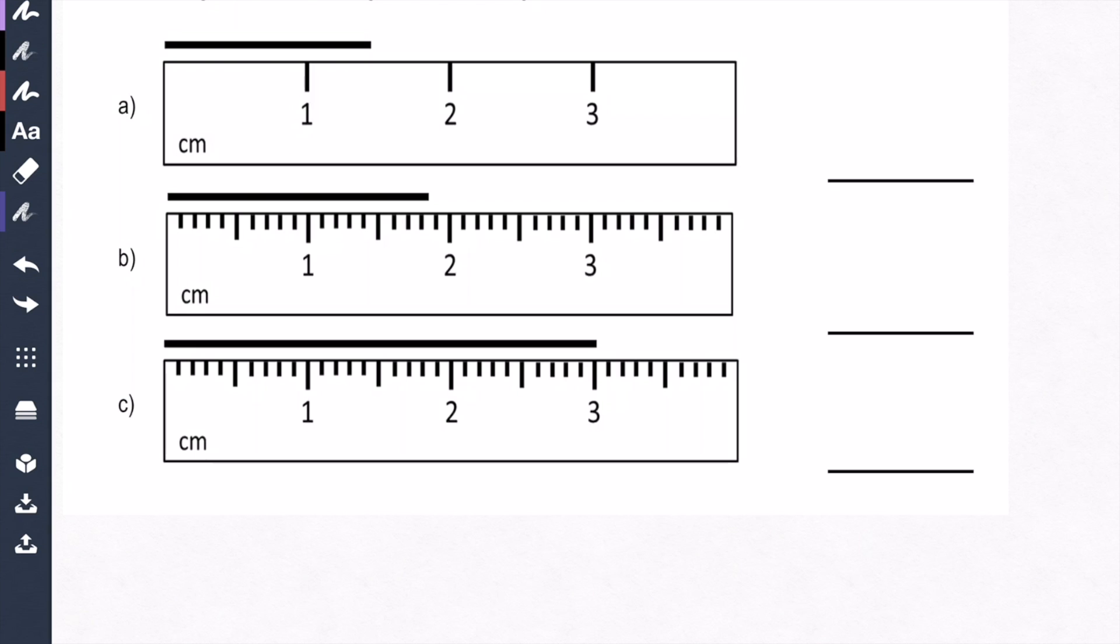Now, the first ruler, ruler A, we're dealing with this one right here, doesn't have any small hash marks. It only has large hash marks. Notice these hash marks are measuring one centimeter. This right here is the one centimeter mark. This is the two centimeter mark. This is the three centimeter mark. So this ruler, you can read the one centimeter mark.